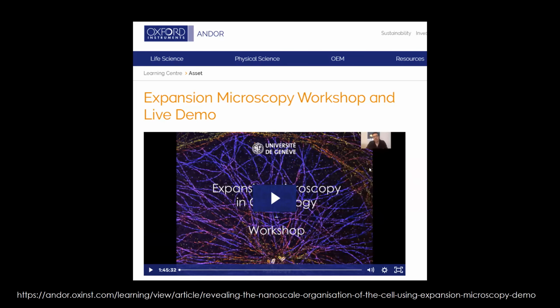Actually, for my imaging, I also use the spinning disc Dragonfly microscope, which is a really nice confocal spinning disc. Because the samples are so large, the amount of data that you need to collect is enormous, and it's better to use a fast microscope than a slow one.